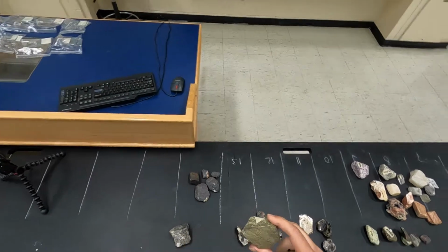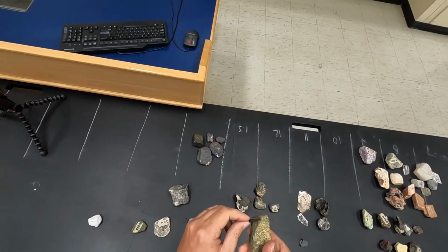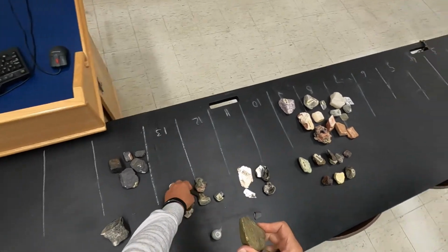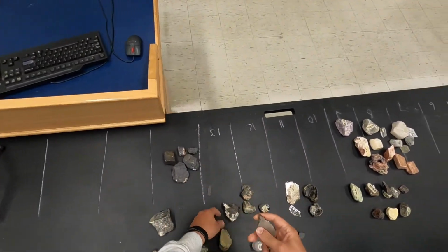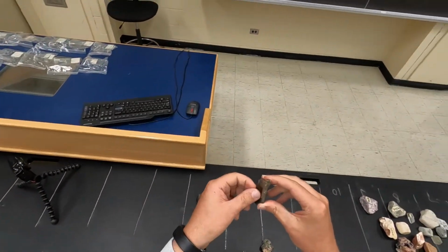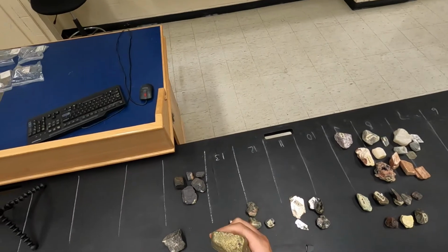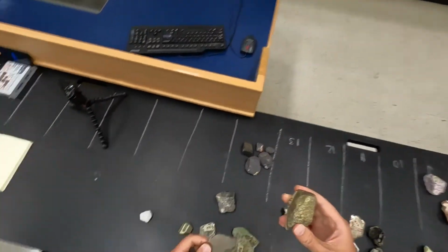We have some pyrrhotite in here, which can be misleading, but if you really select portions of this crystal that don't have pyrrhotite, it doesn't stick really. So you can see it's actually slipping through. In this one, it sticks quite easily. So that's mostly pyrrhotite, that's mostly pyrrhotite, and a little bit of chalcopyrite in this particular specimen.